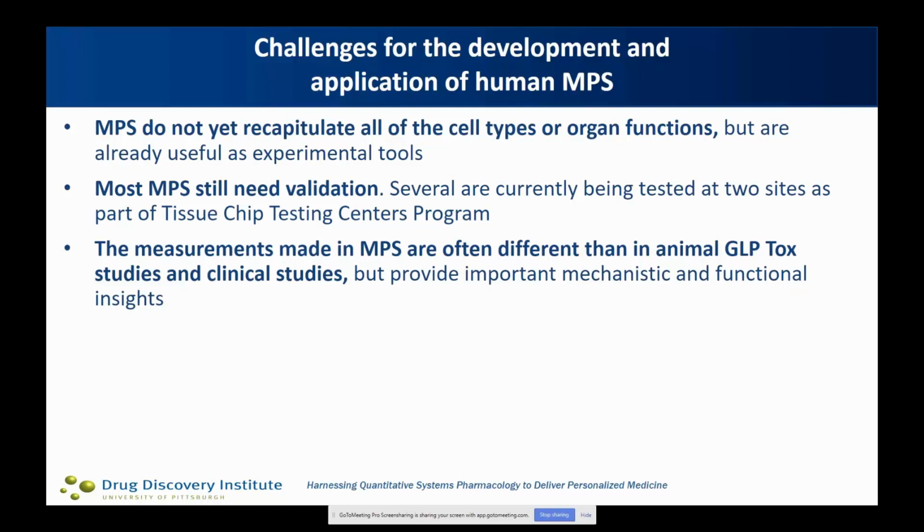And we envision that being an exercise in modeling, taking the data that's generated in these experimental models and using that along with reference data from drugs where there has been human exposure, and we do have clinical reference data, and then building computational models that will relate those two.